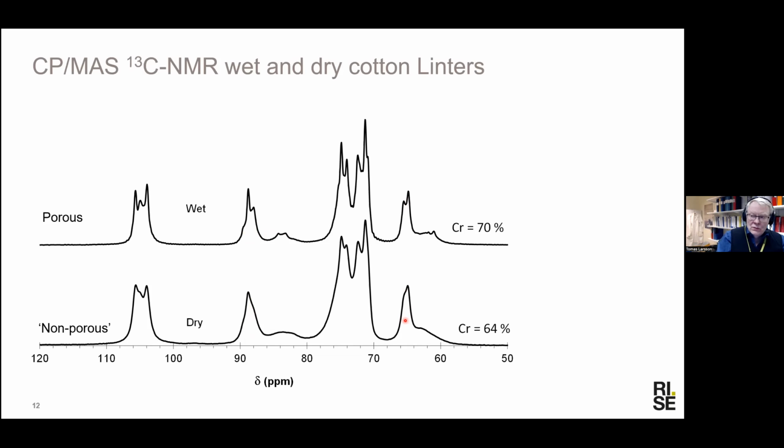We have geometrical mismatches that, when water is removed, don't fit quite well together, and for that reason we can get tilted or twisted or bent crystalline domains, which become, in a sense, less crystalline. It's perfectly reversible after first time drying. You can go back and forth between these two spectra without much change. But first time drying always induces a permanent or more or less irreversible change.